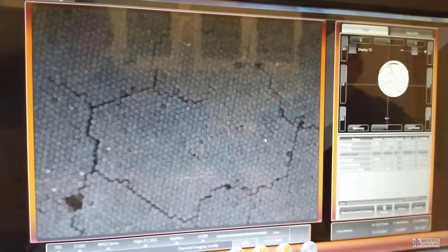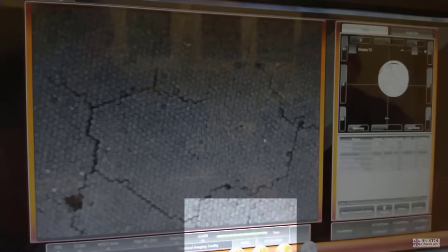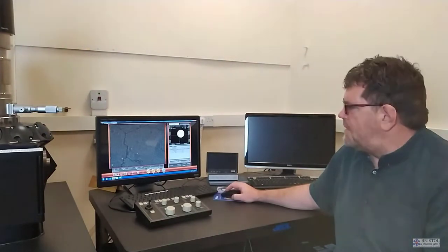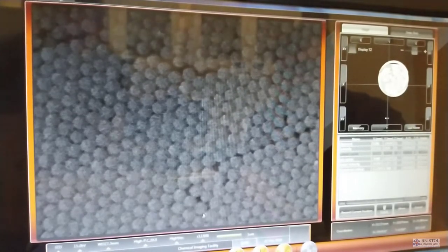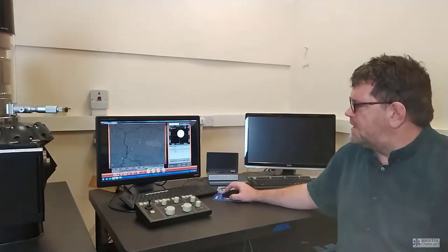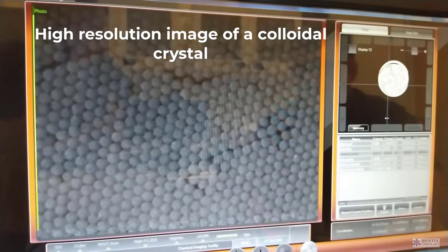Now at 10,000 times magnification, what we're imaging is not a crystal. The scale bar, the green bar, is one millionth of a meter. These are small silica or glass particles that are of the order of 200 nanometers in diameter, and they close pack together just like close packing oranges together or ions in a crystal. There are groups making these colloidal particles and controlling their size so they're all very uniform. When dried down, they close pack into cubic or hexagonal close packed arrays on a surface. You should be able to make out the hexagonal arrangement of the individual particles. The space between the spheres is also of the order of hundreds of nanometers.